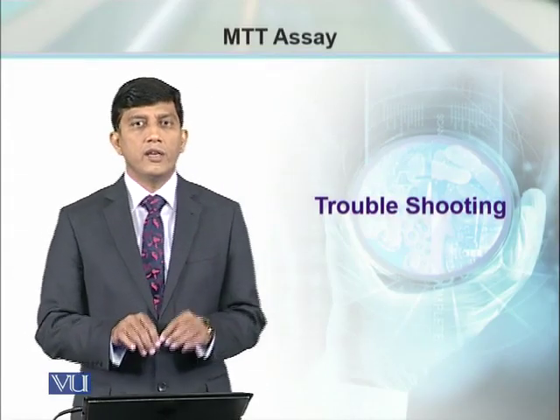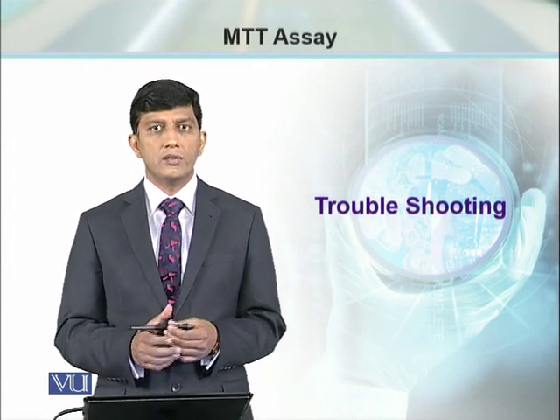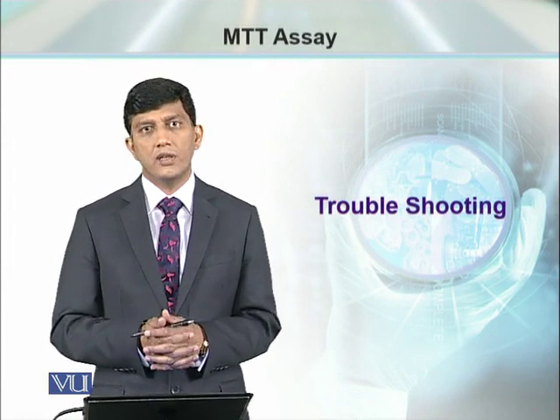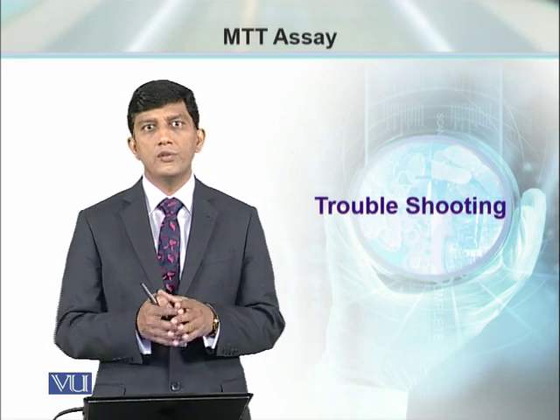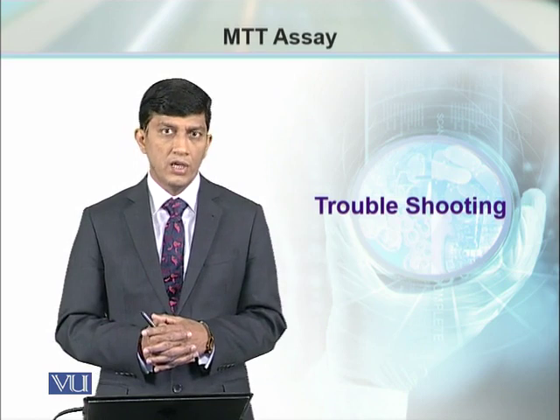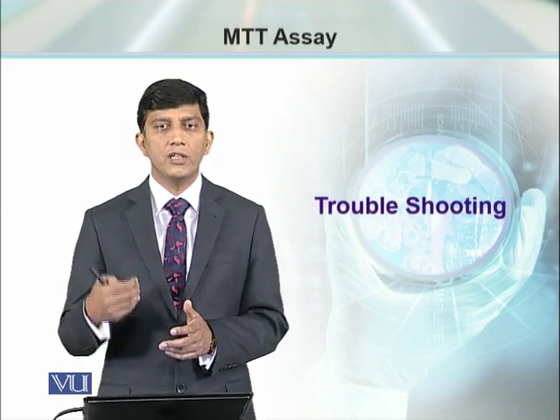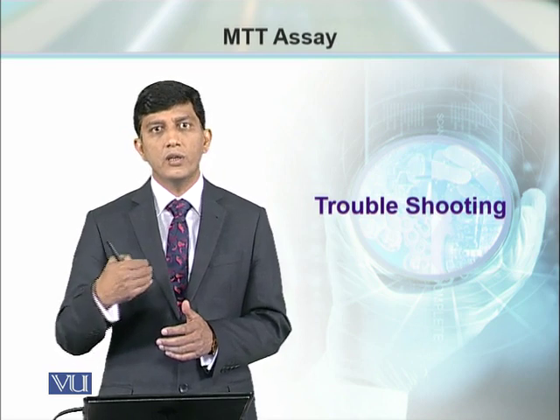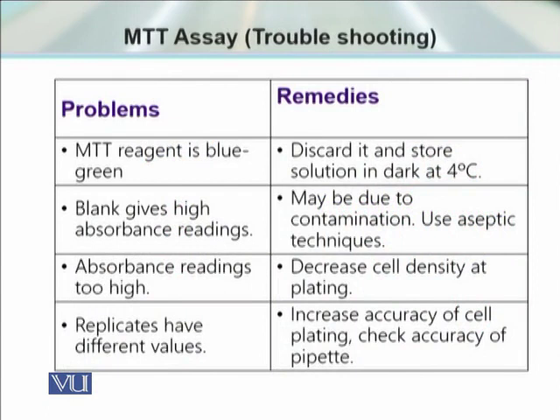Sometimes at the end of the assay, we see that the results are not consistent. The results are quite out of the way that we fail to interpret those results. So in this situation we have to go back and see where we made a mistake. That we call as troubleshooting.